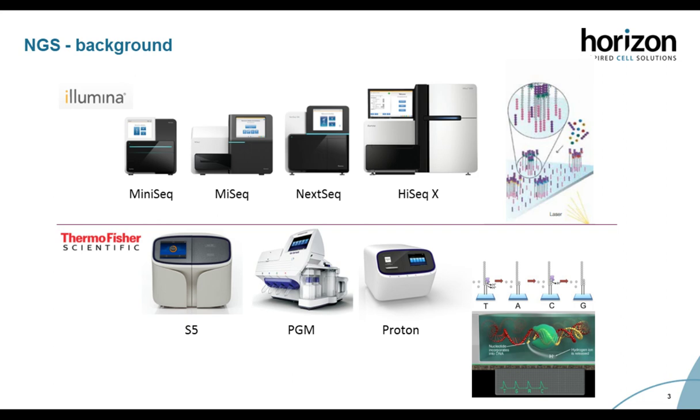The majority of the reference standards that we manufacture at Horizon are aimed at the NGS user group. NGS stands for Next Generation Sequencing. And the two main providers of NGS platforms are Illumina and Thermo Fisher Scientific, both companies offering multiple different sequencing models. Here you can see them displayed on the slide. Both technologies offer sequencing by synthesis, with Illumina's technology being based on fluorescence and the Thermo Fisher Scientific Ion Proton technology being based on charge.